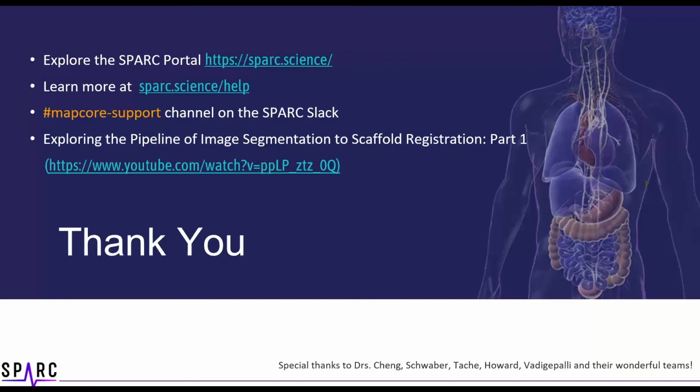If I get your question correctly, the question is whether it's possible to label individual cell groups visible on the scaffold on the portal.